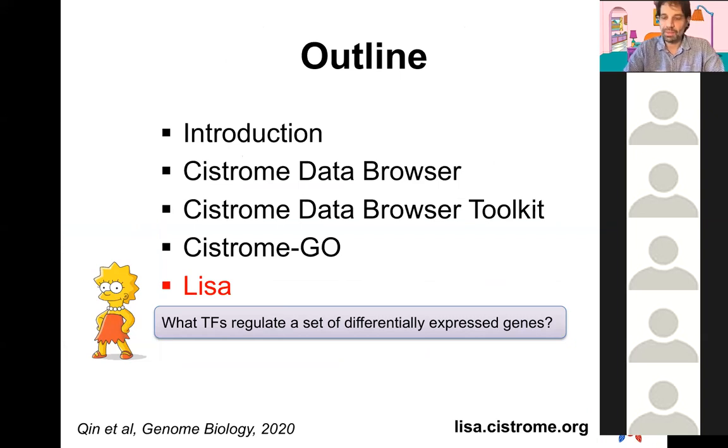Cliff, may I ask a small question? We haven't used some of the more recent tools you talked about, but we've gotten a lot of value out of BETA, and probably cited that paper multiple times. I wonder if there's any move in the group to make the output from BETA a little more user-friendly, a little more intuitive, and also a little sexier. The way it currently puts out, we include it in papers, but I'm not sure that reviewers or readers fully grasp it.